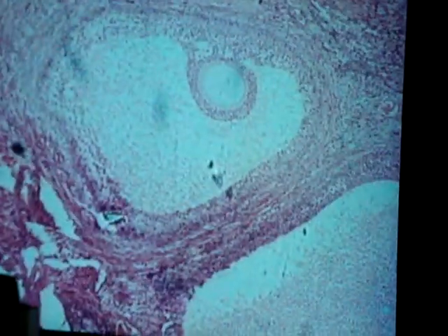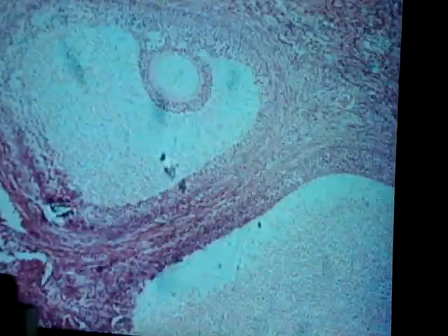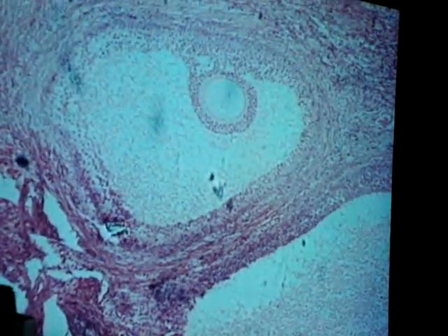So is that big thing another one of those corpus? Yeah, the other one, which one? Like that one right next to this column right there? Not yet. Not yet. That's one that maybe just expelled its egg. Oh, okay.